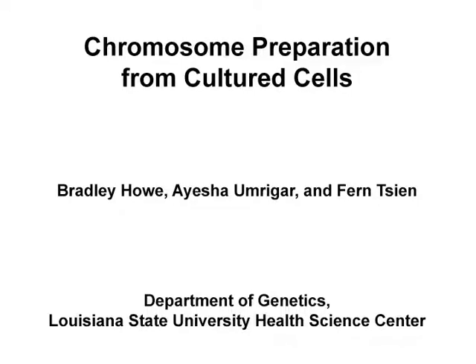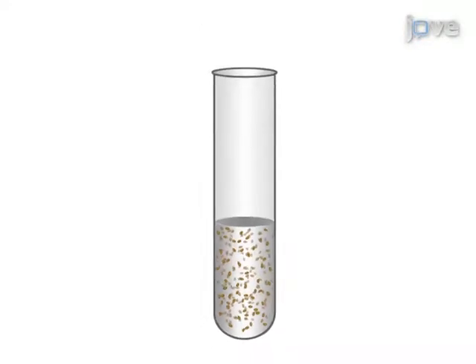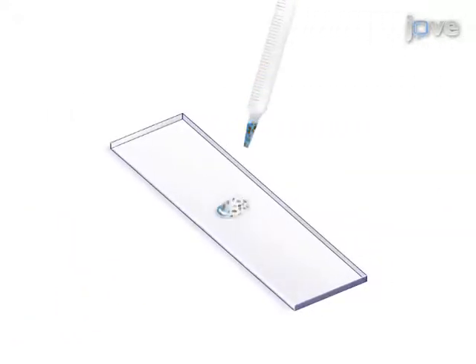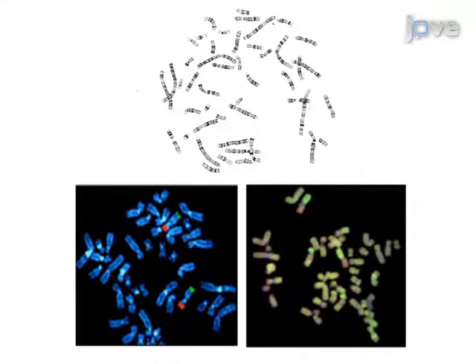The overall goal of this procedure is to harvest and prepare chromosomes for G-banding and molecular cytogenetic tests. First, culture the cells to logarithmic phase, then harvest the chromosomes with colsumid, a hypotonic solution, and a fixative. Drop the cell suspension onto slides, then stain one slide as a monitor of the chromosomal preparation.